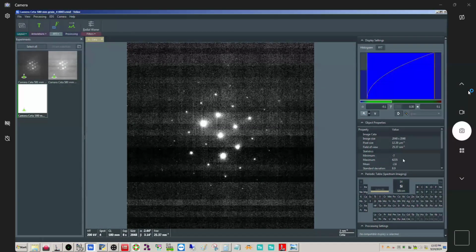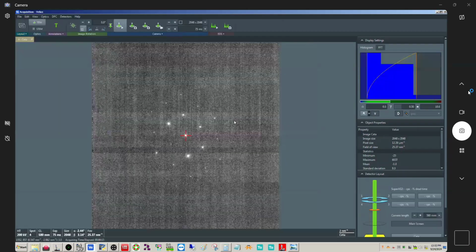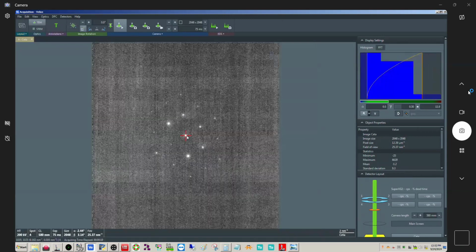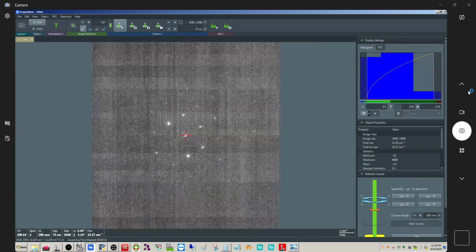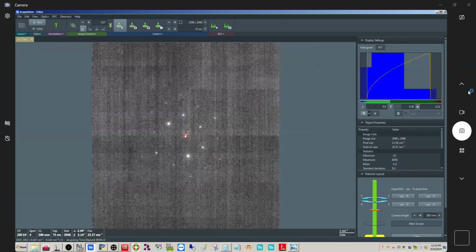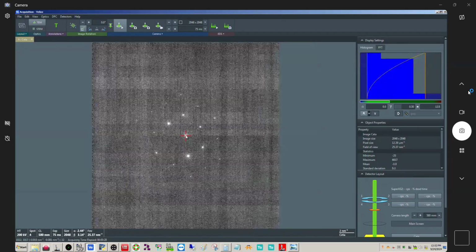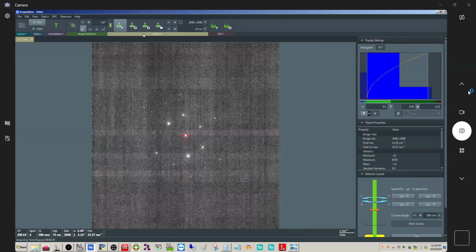Okay, so now we're not clipping. Now this is obviously not great looking, so what can we do here? Since we can't combine any more frames, we can do a series acquisition. The other thing we can try is blocking the direct beam. The problem with that, of course, is that the pattern is then not going to be centered anymore. Depending on where the beam stop is, that's going to dictate where the pattern center is. But let's try instead.